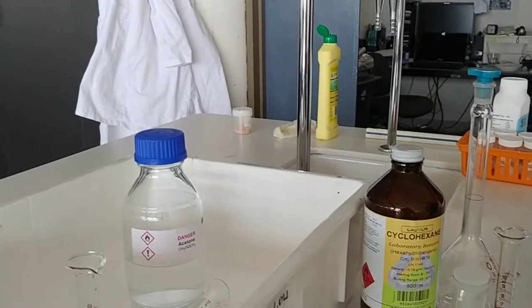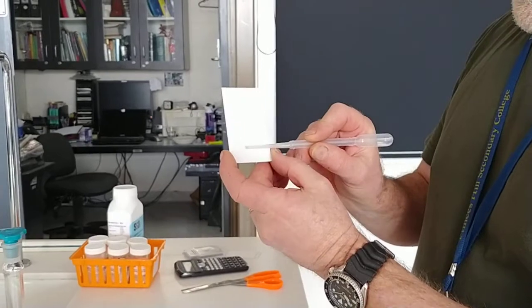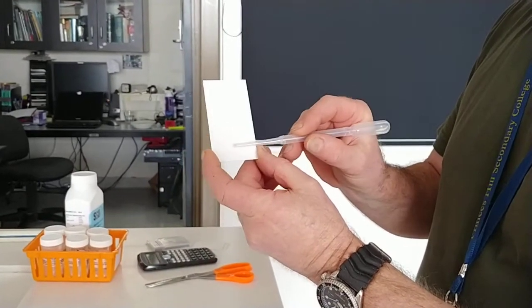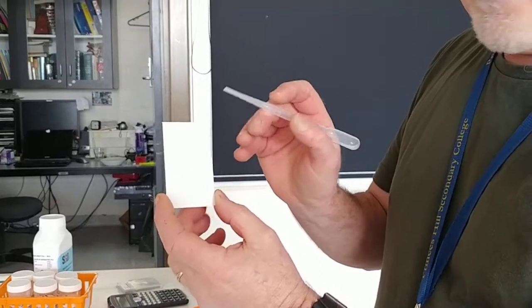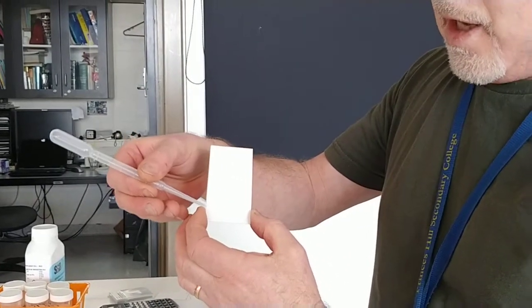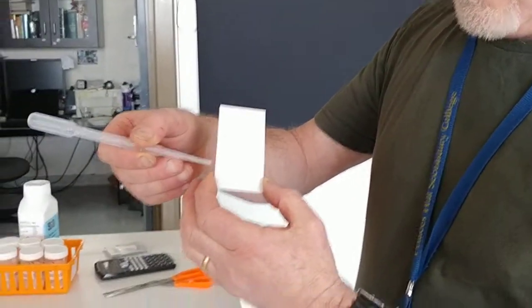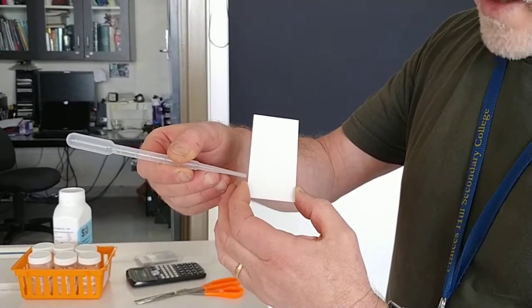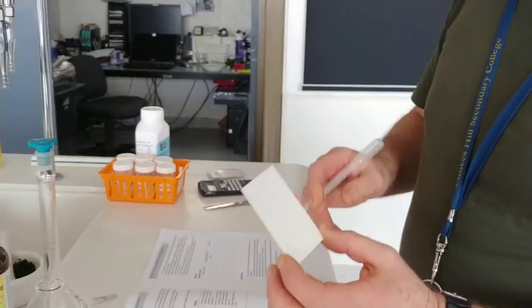And what will happen is the chlorophyll and all the extract from the plant will start moving up this thin layer chromatography plate, and the transport mechanism is going to be the solvent. The lighter chemicals or the lighter compounds will travel further, and the heavier ones, of course, will deposit a bit lower. We'll go through that in a second.